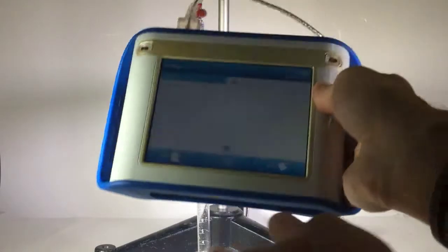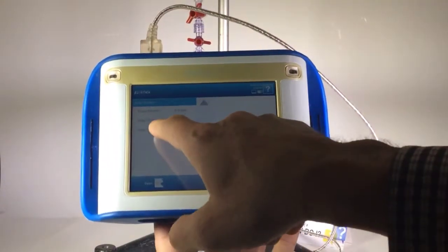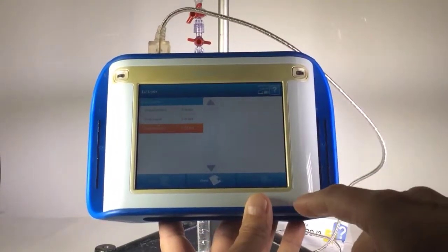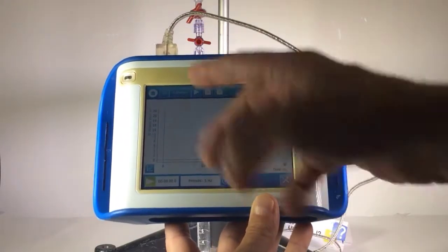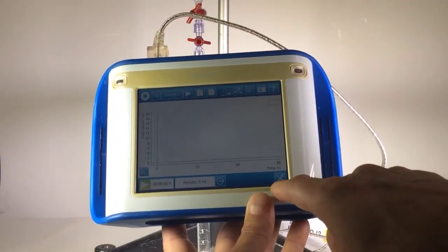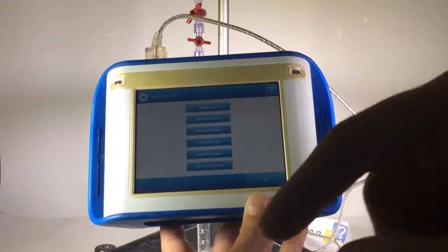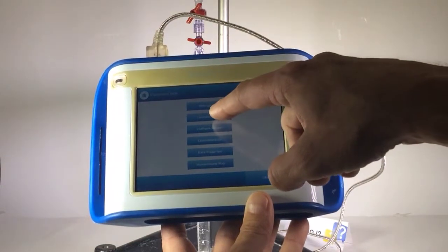Alright, I've plugged it into my Spark. I'm going to touch fluid volume, show, which brings up a graph of course, but I also see the wrench and screwdriver. When I touch that it says calibrate sensor.